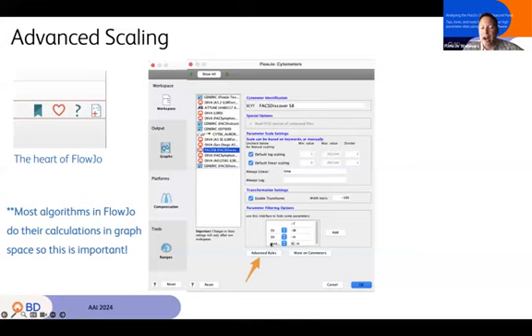But I added an "and not" here because I want to see scatter. I want to see forward and side scatter dash H so I can use that for diagnostic purposes. So you can set up your parameter filtering right here any way you like, to hide parameters and make your displays of parameters simpler. This has been in FlowJo forever. It's a small spot in preferences, but very important now with really high dimensional panels. Just adding a dash H to every one of your measured parameters can add a lot to your list.